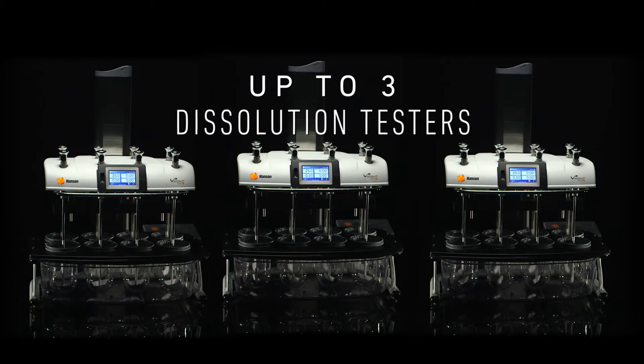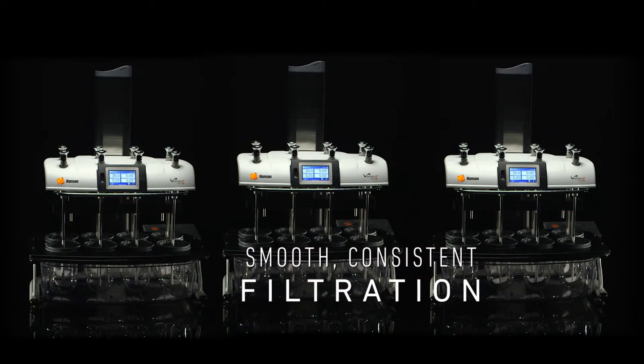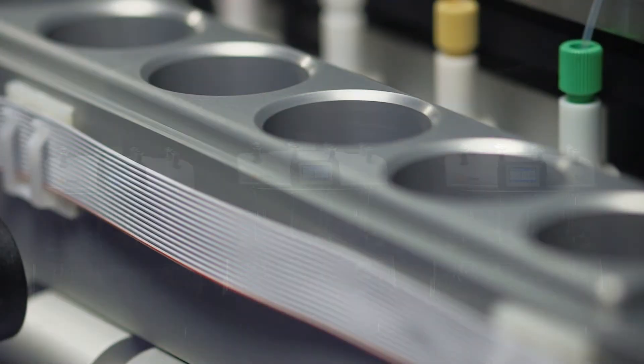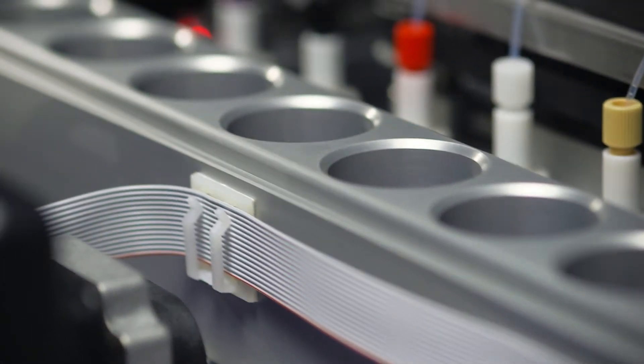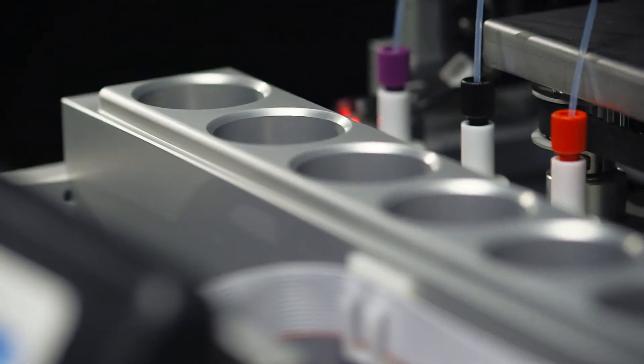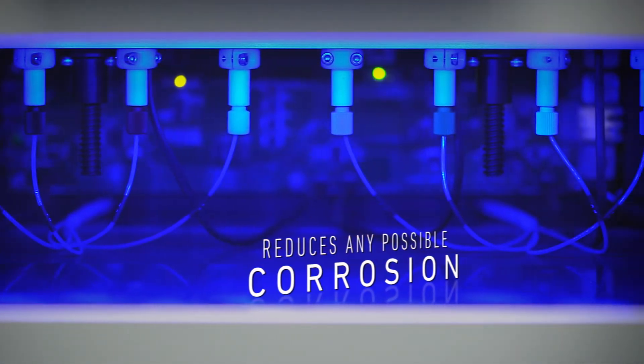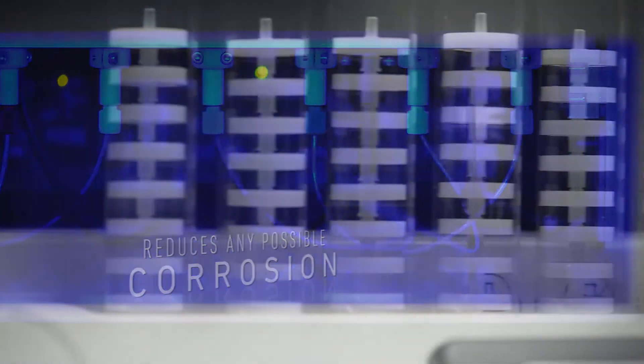Compatibility with up to three Hansen Vision dissolution testers ensures smooth, consistent filtration and maximum throughput of samples. Designed with high-quality inert materials with protective layers of water-resistant coating, the internal mechanics are designed to reduce any possible corrosion.